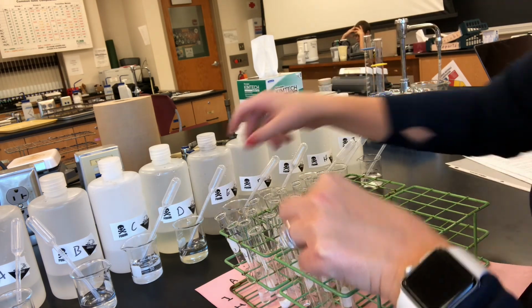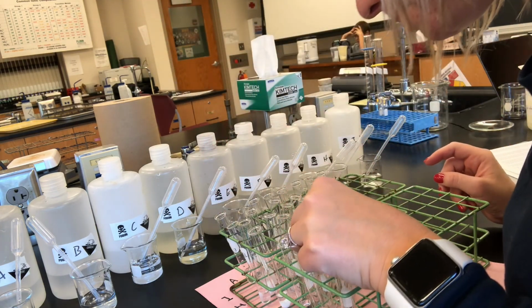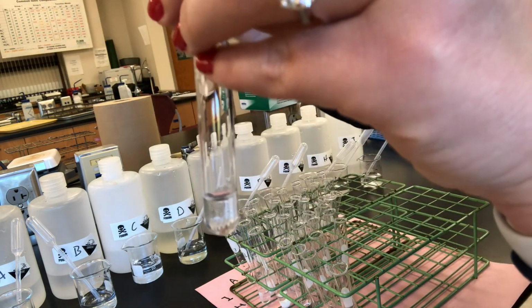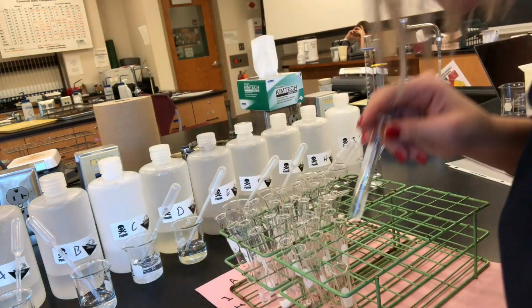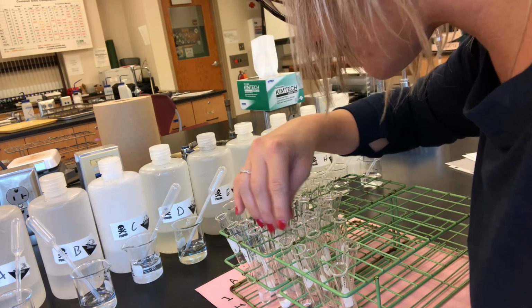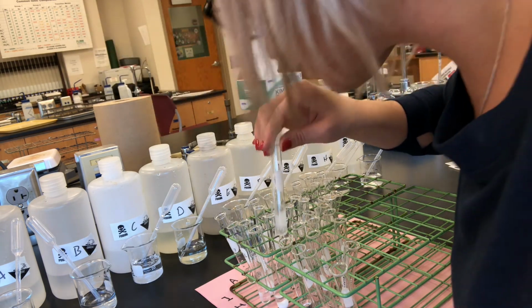B and D. B and D. No change. All right, B and C. B and C. No change. All right, let's see. Let me look down through, see if I can recap. B and H gave me a precipitate, as well as I thought there was another one. Yes, B and F. Mix back together. There we go, B and F.